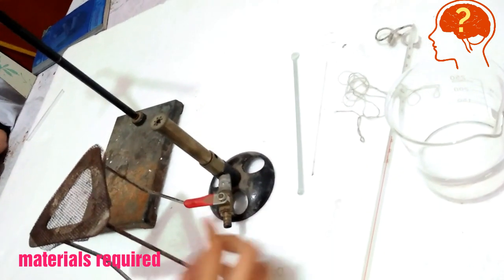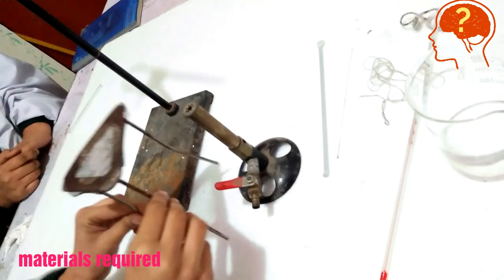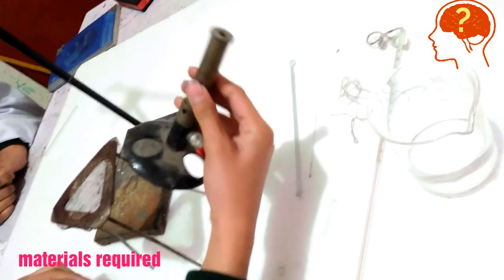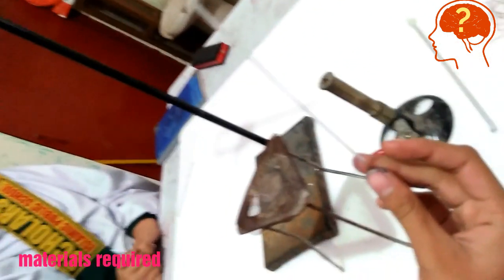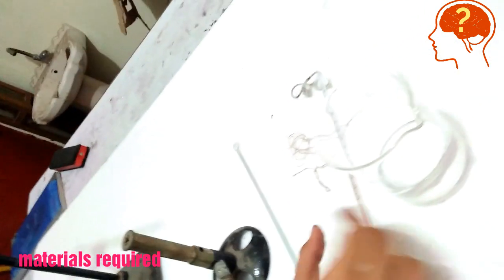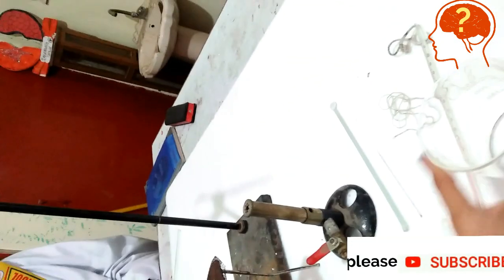you need fusion tube, tripod stand, bunsen burner, iron stand, capillary tube, beaker containing water and thermometer.